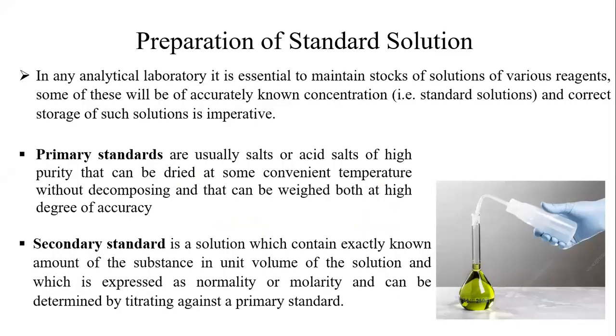In any analytical laboratory, it is very essential to prepare and maintain stock solutions of various reagents. Some of these have an accurately known concentration. A standard solution is one whose accurate concentration we know, and the correct storage of such a solution is very imperative, that means very important. Whenever we work in any analytical laboratory, we should maintain some stock solutions, the primary standards. We should know the concentration, whether the normality, the molarity, or how much quantity it is. We should know all those things.